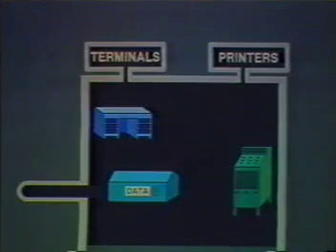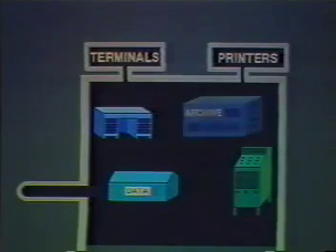Unless you have some reason to keep your data private, it's a good idea to archive the analysis drawer for each experiment as soon as you have completed your data collection. That way, in case you accidentally delete an analysis drawer from your desk, you can always ask the magic secretary to retrieve a copy of it from the archive.